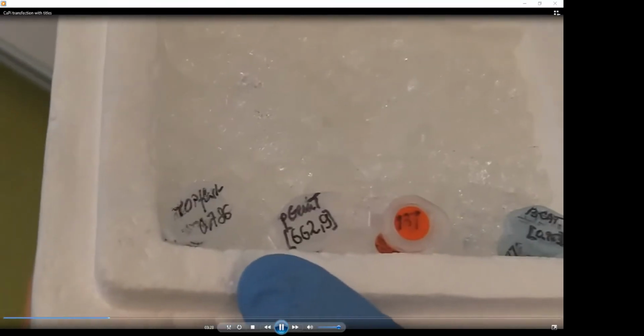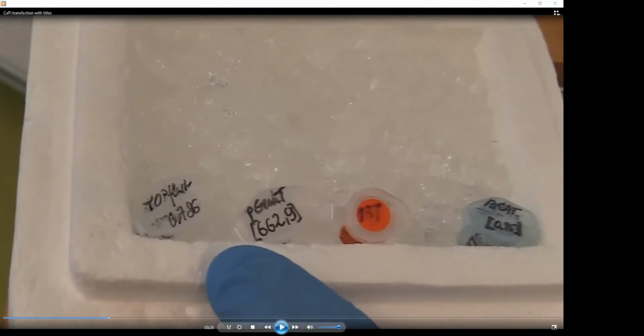which we split into the following samples. So that means everything what is common for all samples comes to the master mix. You have to calculate it. And then you take out from this master mix parts which you enrich with the individual DNAs for each sample. DNAs are always kept at -20 degrees for long-term storage, but when you are doing the experiment itself, you have to thaw them and then put them on ice.